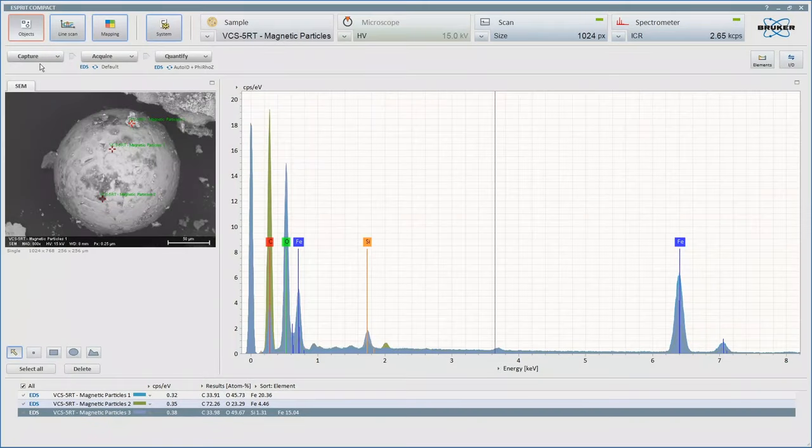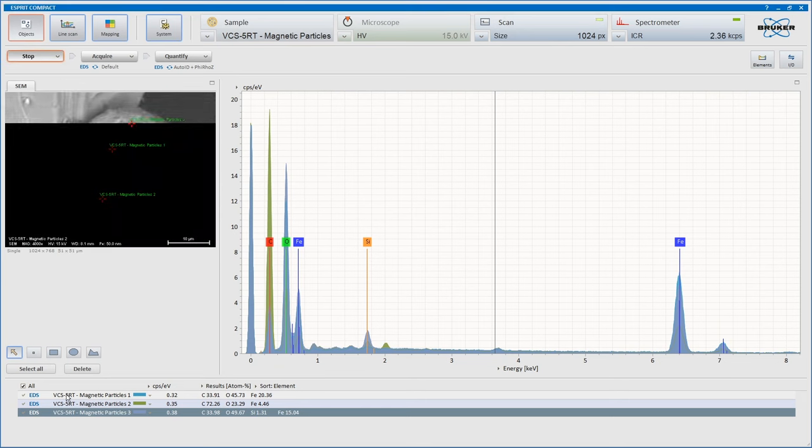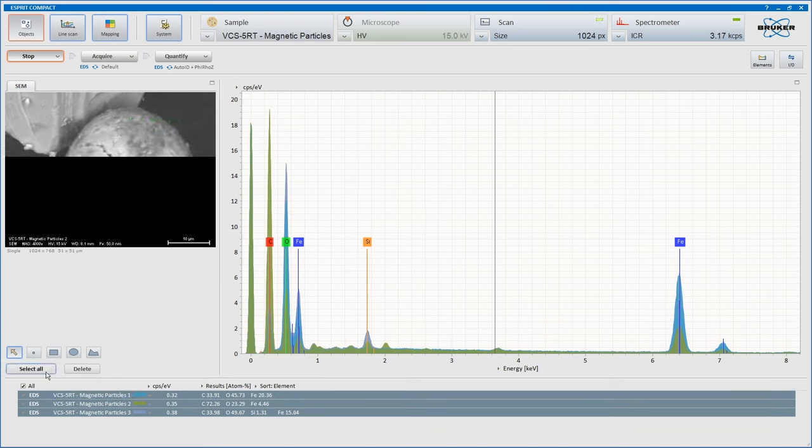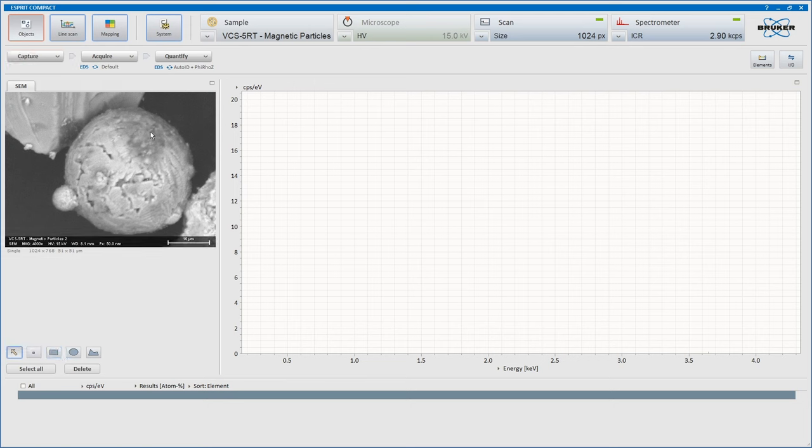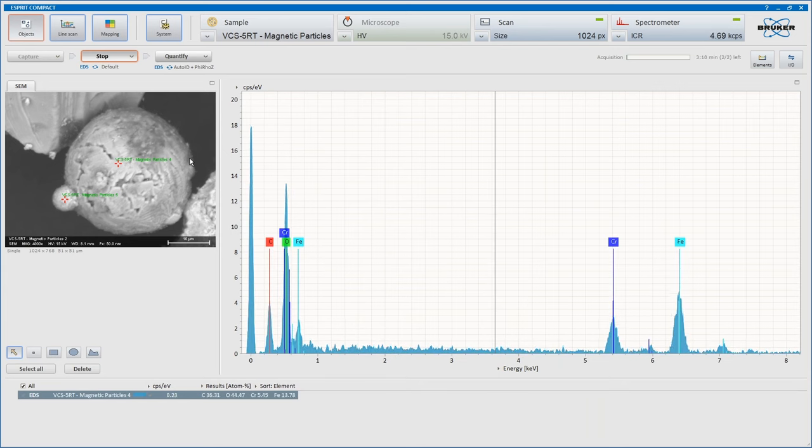Let's go over and capture that over here. Clear those. I suspect this is going to be iron. You can see the crenellations on this one as well, but I suspect it's going to be iron. So we'll go there and we'll have a look at this little one as well. So we'll have a look at those two. Acquire. Aha!